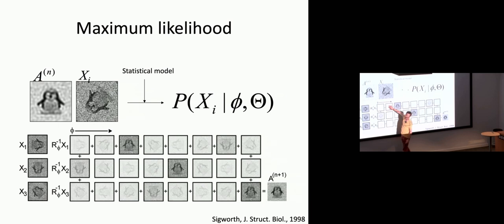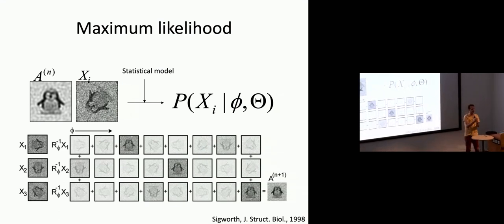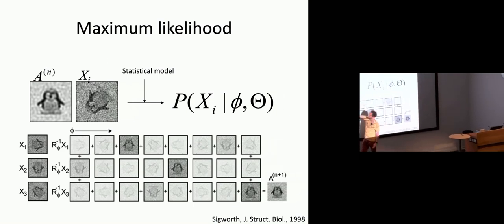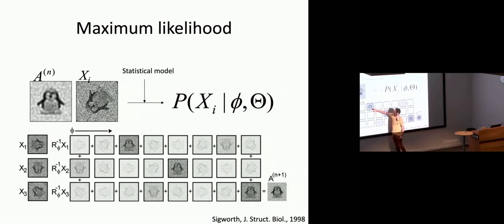Now, I rotate it 45 degrees, still low, but once it's in the correct orientation, then the difference between the images will be smaller, the cross correlation will be higher, the probability will be higher. So that's indicated on this line: different rotations of this image, and the transparency of the image is related to the probability, with more opaque images having higher probability.